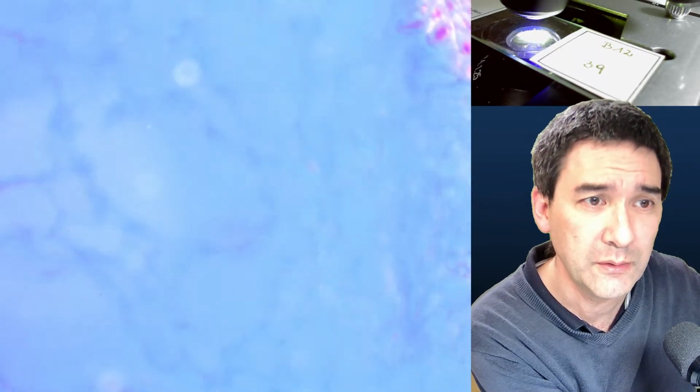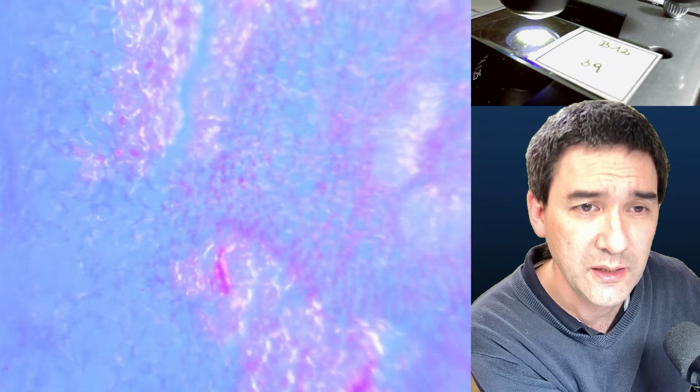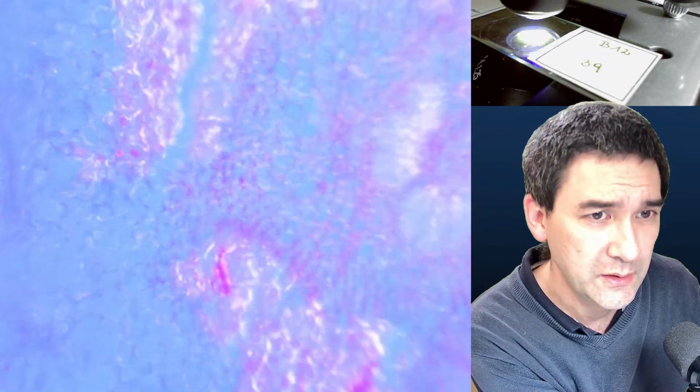And these plant cells are a little bit challenging, because I'm just going to be using now red, blue, yellow. But I did see something quite interesting. I have to put it in here, and everything is on the top. I have to find the focus, and I have to make sure that, just a second, I have to open up everything here again. Okay.